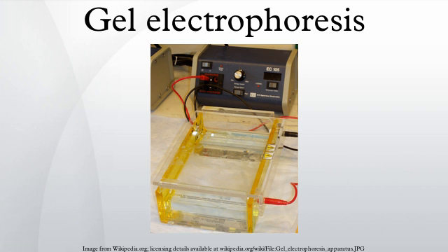There are limits to electrophoretic techniques. Since passing current through a gel causes heating, gels may melt during electrophoresis. Electrophoresis is performed in buffer solutions to reduce pH changes due to the electric field, which is important because the charge of DNA and RNA depends on pH, but running for too long can exhaust the buffering capacity of the solution. Further, different preparations of genetic material may not migrate consistently with each other, for morphological or other reasons.